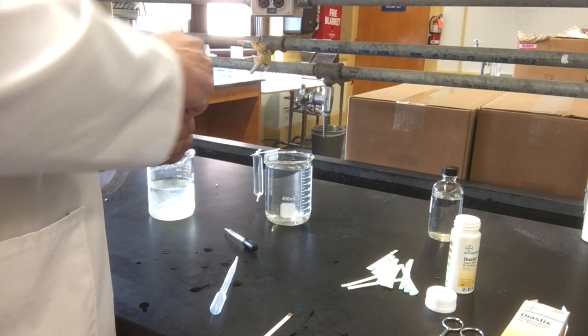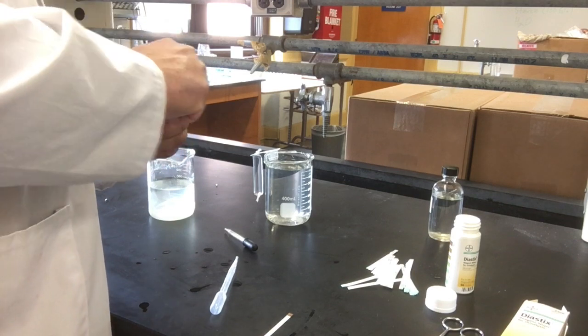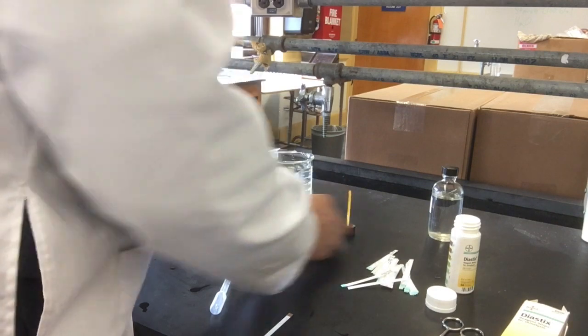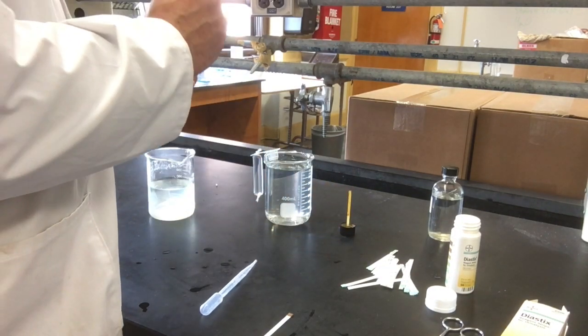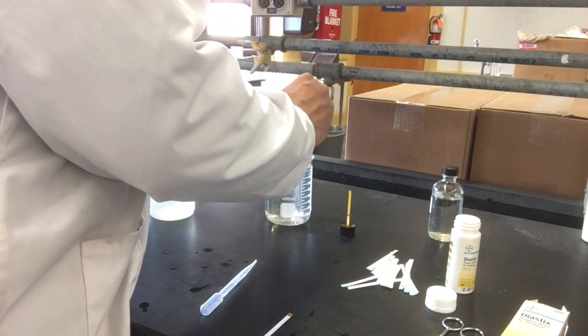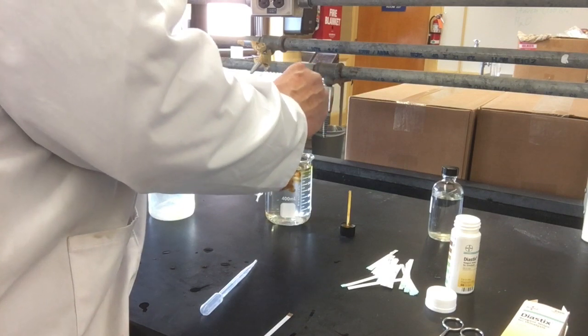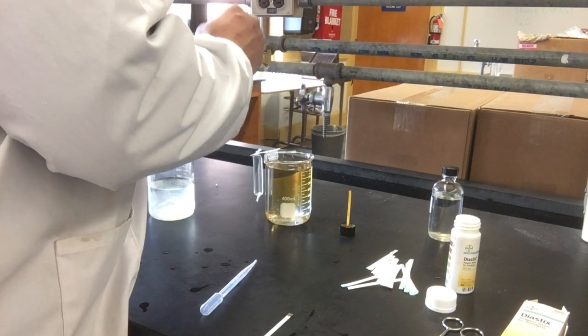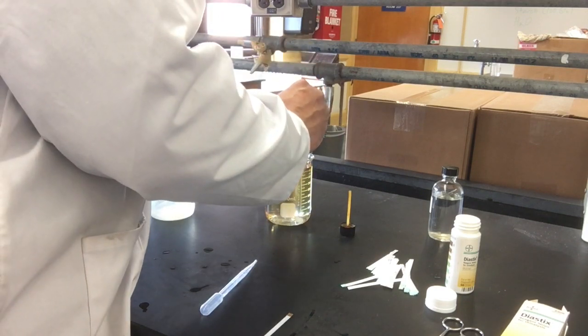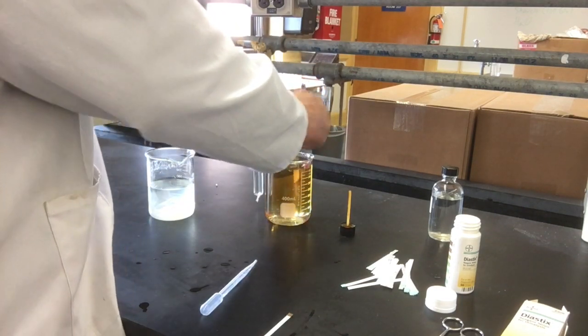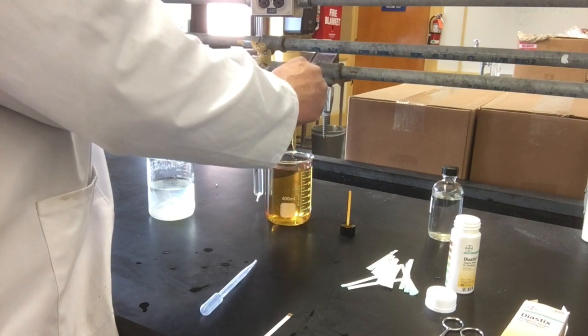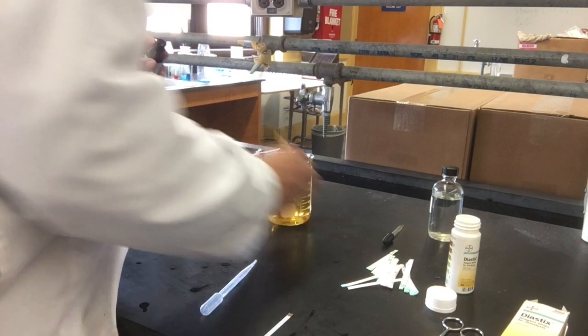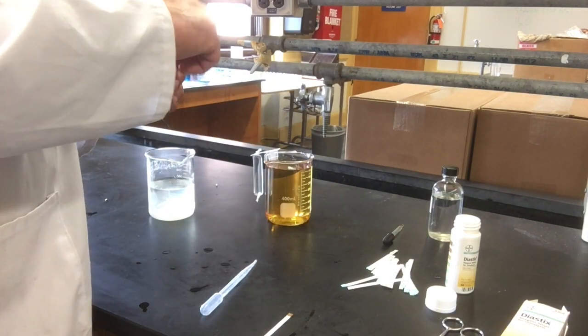Iodine binds to starch and turns color. I'll use a glass eyedropper to add iodine until the water is a light tea color. That's good. I'll put the cap back on to avoid spills.